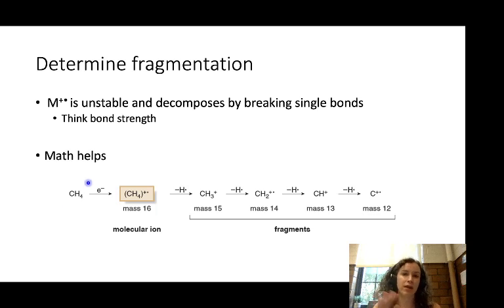And an example of a very simple mass spectrum is given below. For example, let's say you have a spectrum, you see masses of 16, 15, 14, etc. We know the molecule we're working with is CH4. We've got some methane. We should be able to identify that the molecule with a mass of 16 is the parent or molecular ion. Mass of 15 has lost 1 hydrogen. Mass of 14 has lost 2, etc. The molecules we will be working with are a little bit more complicated. So let's talk about some of the types of fragmentation we can expect.